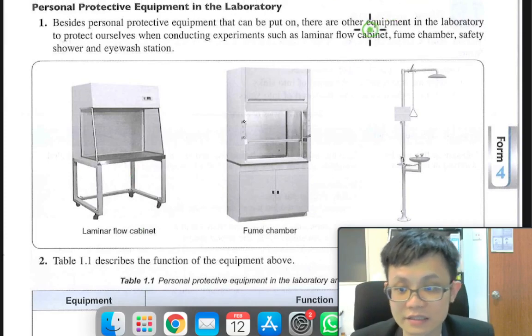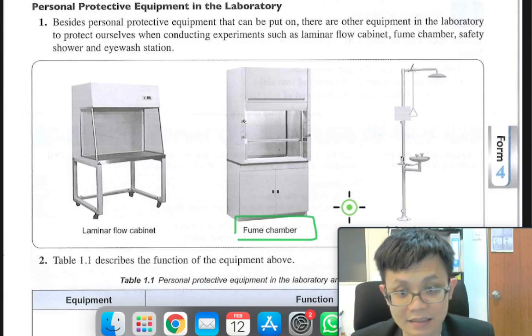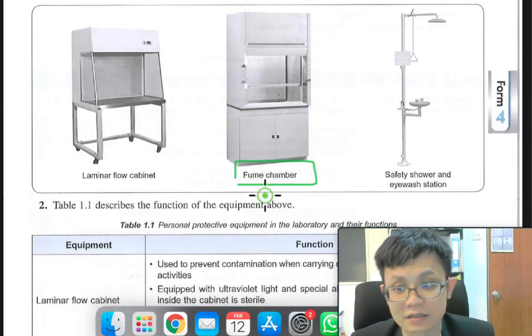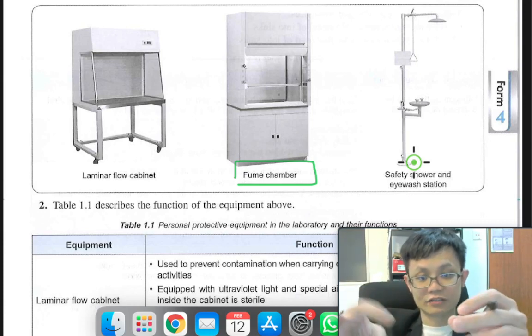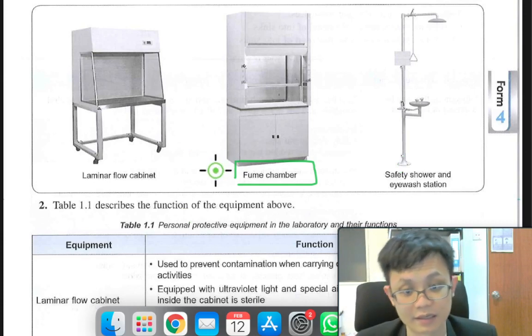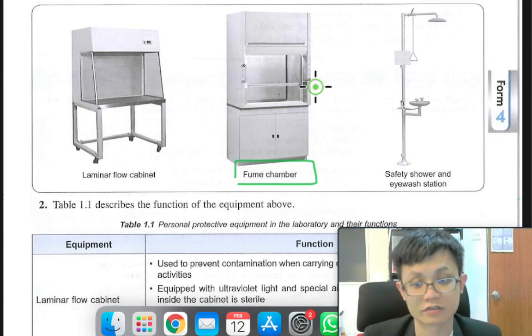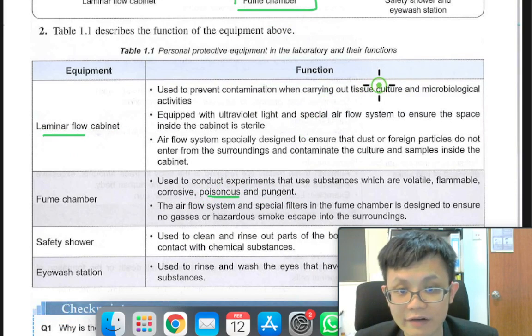Maybe you need to know the fume chamber, where you do something that has a lot of gas. Fume is like gas. You don't want to smell it, so you put your hand inside and work inside. The gas will stay inside, so it is safer for you. For example, a poisonous smell. Laminar flow cabinet is used to carry out tissue culture, to ensure a sterile cabinet.